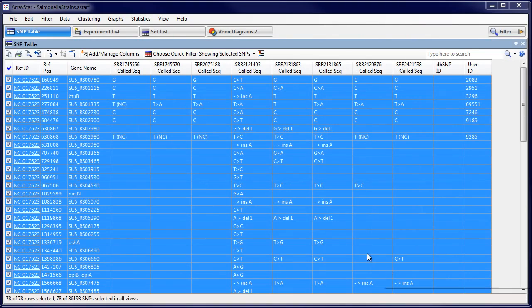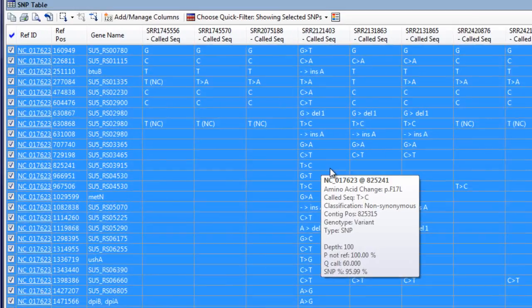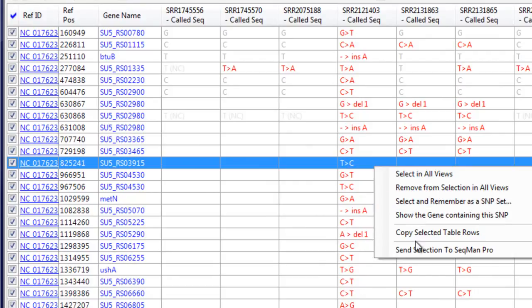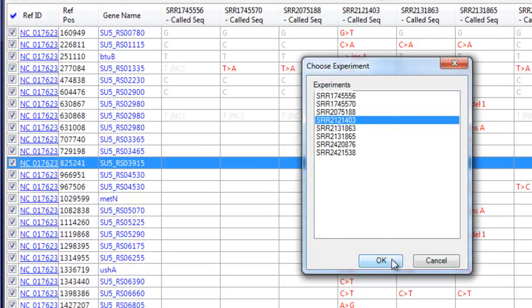For specific SNPs of interest, you can send to SeqMan Pro to view the read alignment at that location.